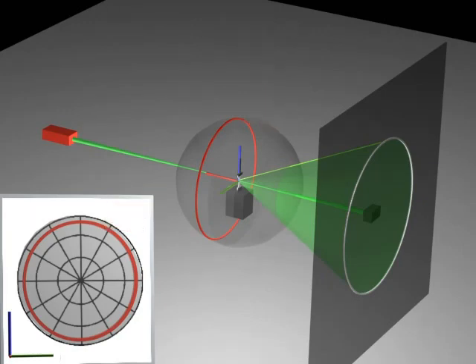As before, additional data can be added to the pole figure by rotation of the loading frame and sample. After an exposure with a beam normal to the specimen surface, the load is held constant and the loading frame is rotated about the loading axis. Additional exposures are taken at prescribed orientations. In this manner, data are added to the pole figure ring by ring.